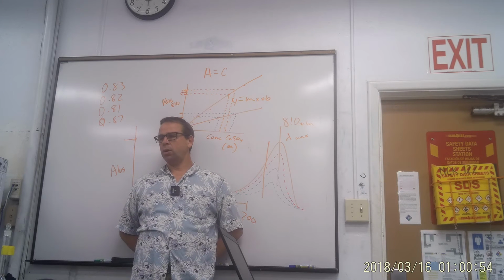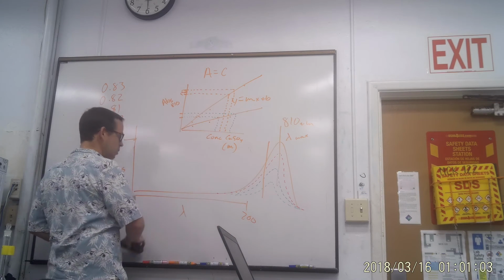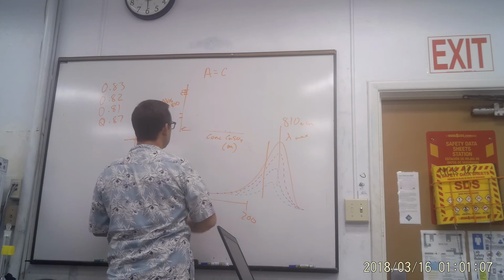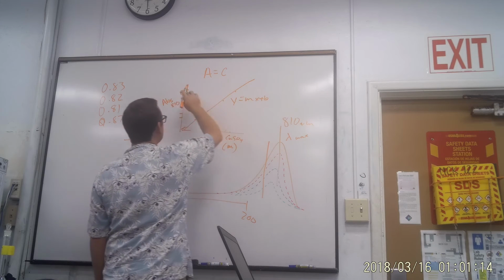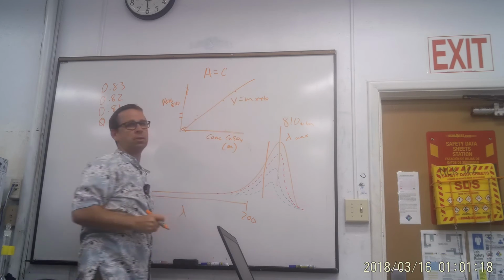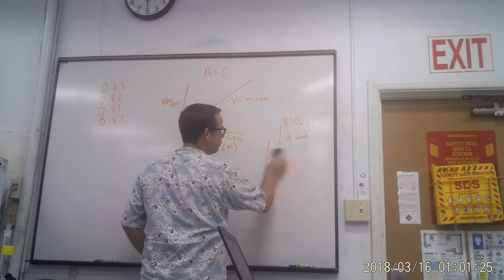Okay, so I think that is all the things that... Oh, we should talk about how we'd identify the concentration of an unknown after we got such a standard curve. Let's clear up our standard curve again. We should also have a talk about when we add y equals mx plus b on an equation, when we put a fit to it. I get scared when I see fits.